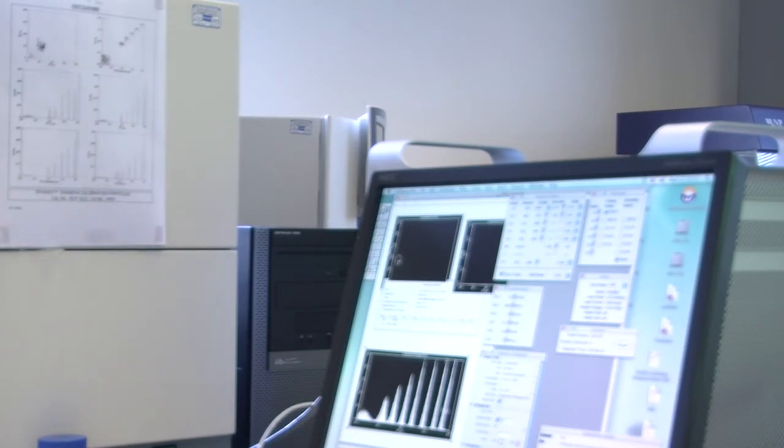Is that what I'm on? Right, so we now need to just finish the final few bits, then we can start running some samples.